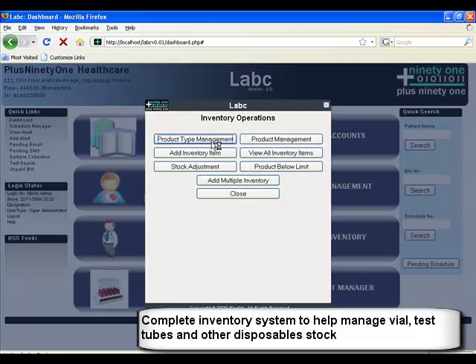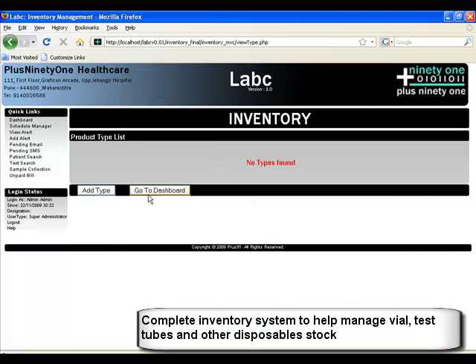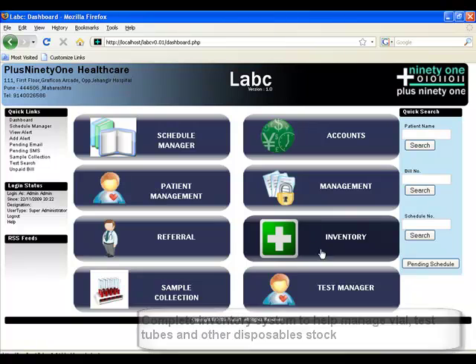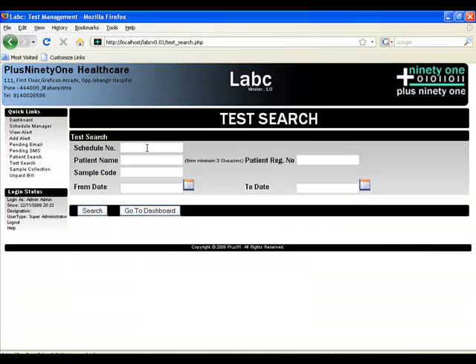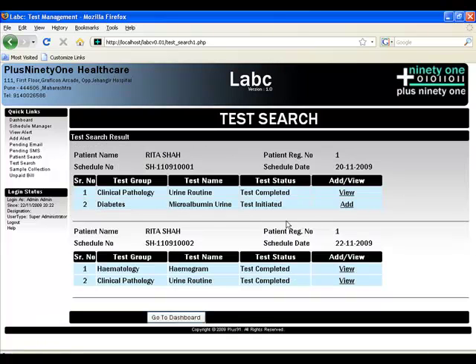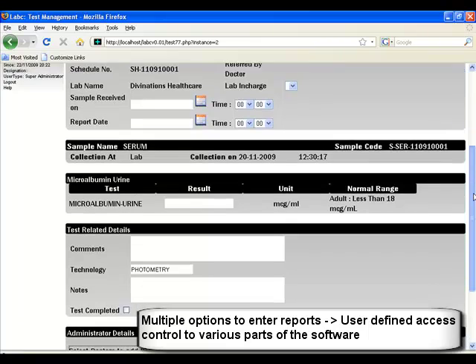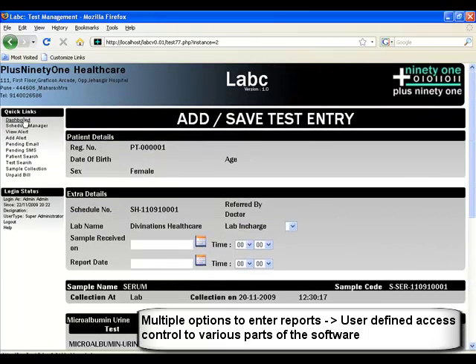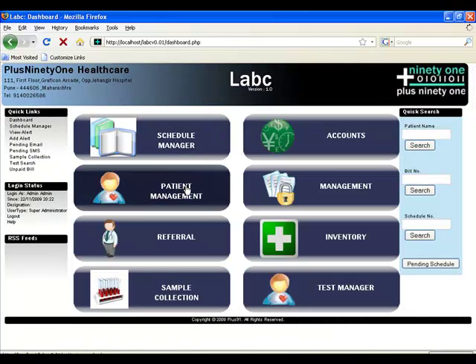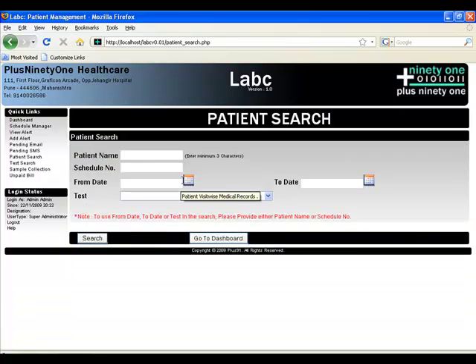Inventory is also handled by the system. You can stay on top of your test tubes and vials, and the system tracks minimum threshold quantities and gives you an alert when stock goes below that number. Test search allows you to search for a particular patient and their test reports. You can directly access a test report from here. This distinction is created so that a lab technician can only be given access to reports from the test manager, without needing to see accounts or other aspects.